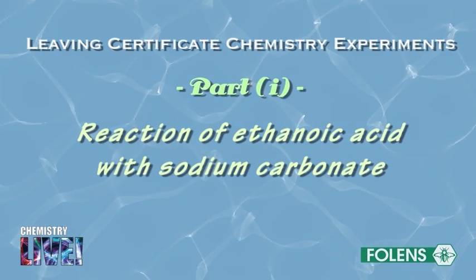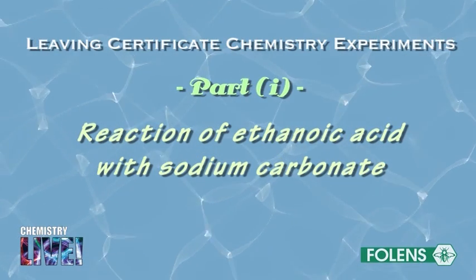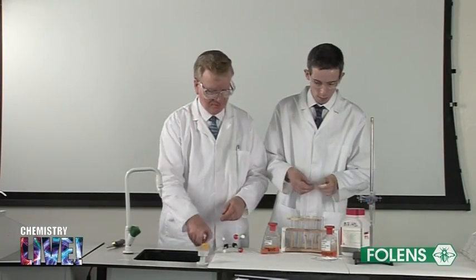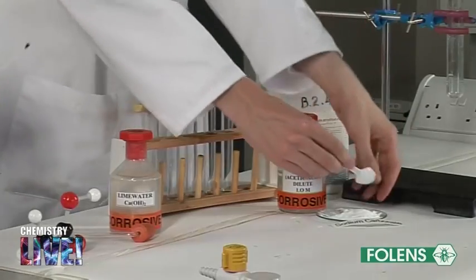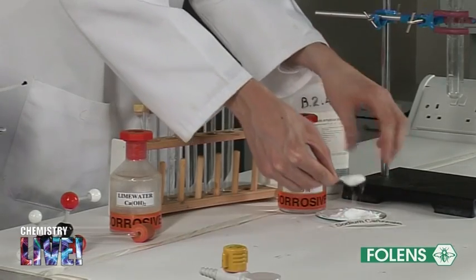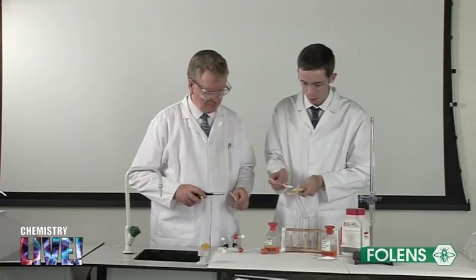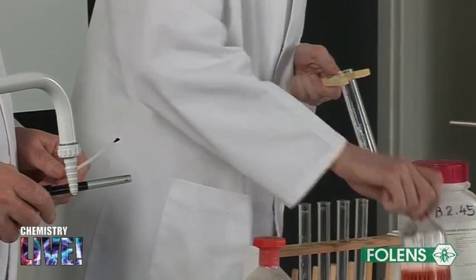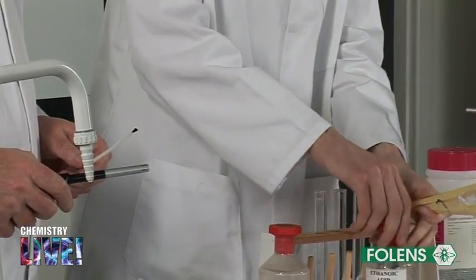We first investigate the reaction of ethanoic acid with sodium carbonate. Some sodium carbonate powder is placed in a test tube or in a boiling tube. Add about one quarter of a test tube of ethanoic acid solution to the sodium carbonate powder.